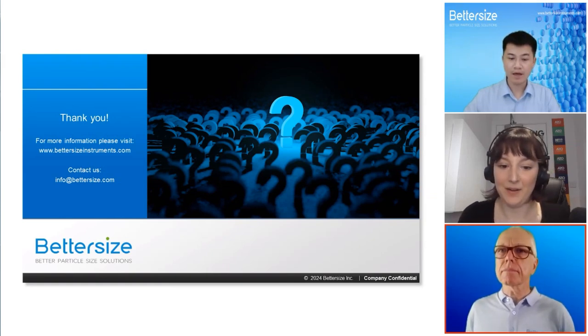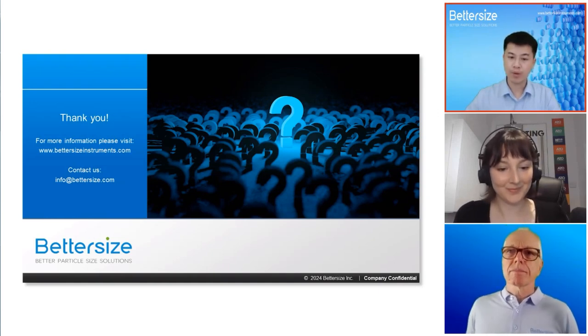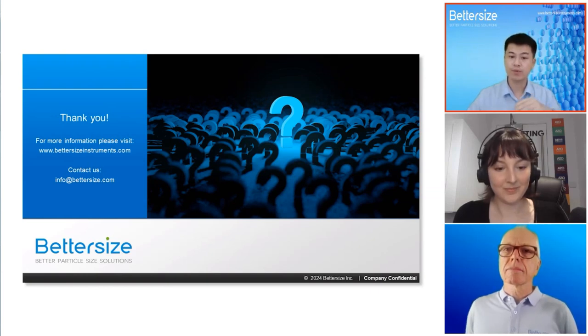Great, thank you. I can add some points. Sample preparation for DLS and zeta potential analysis in the BeNano involves diluting the sample to a suitable concentration, as John explained, to prevent multiple scattering, ensuring the medium's refractive index is known, and removing the aggregates through filtration or centrifugation.